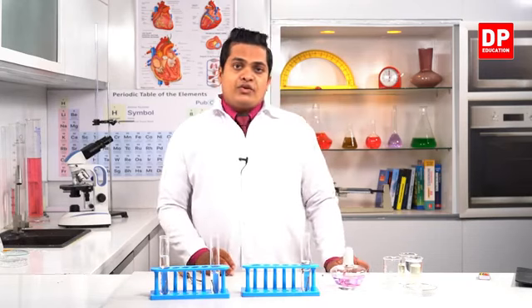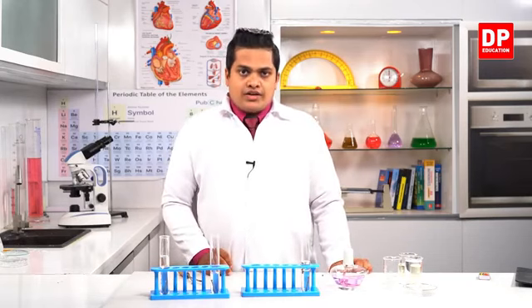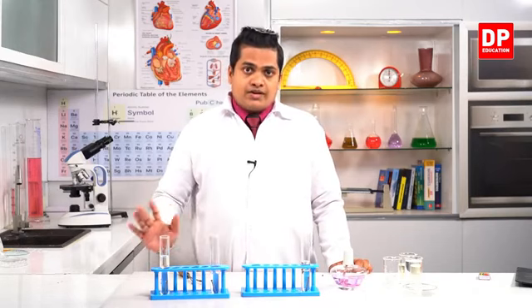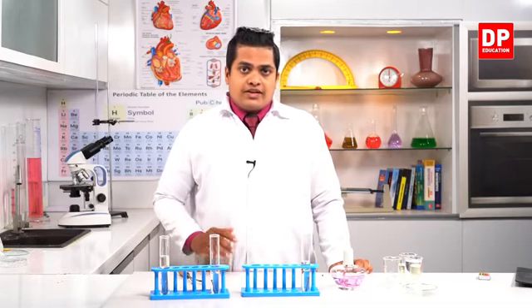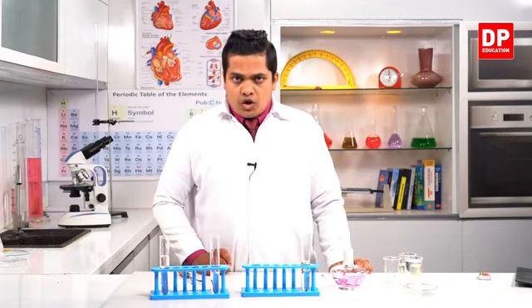Now we need to keep this setup for about 2 to 3 days to get our observations. So we'll keep these setups in a different place so that they would have some time to process. And after 2-3 days, we'll see what our observations are. Right, my dear children?